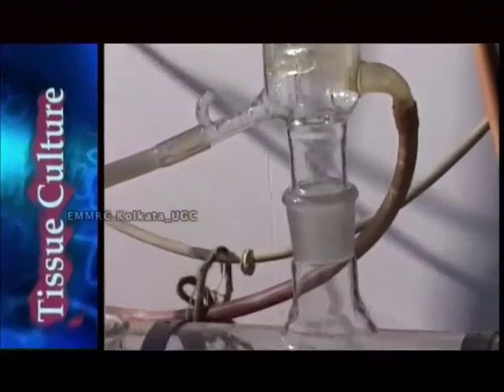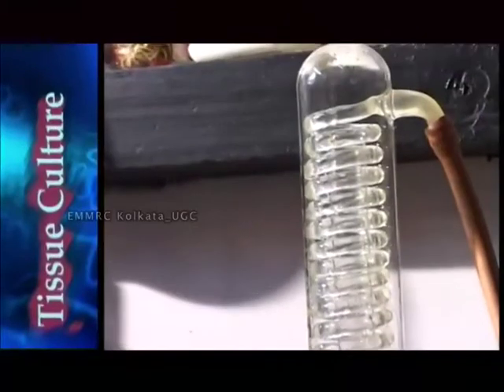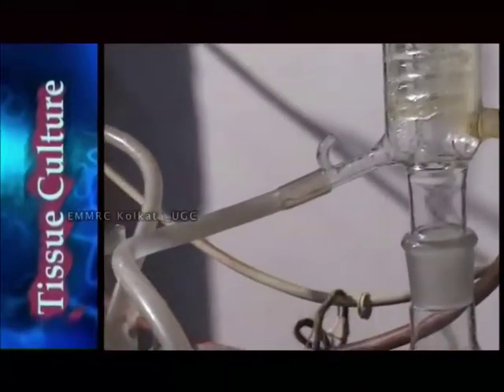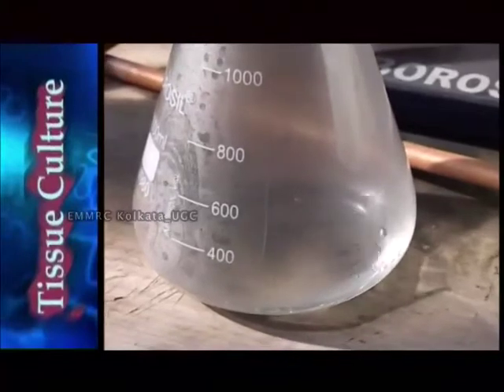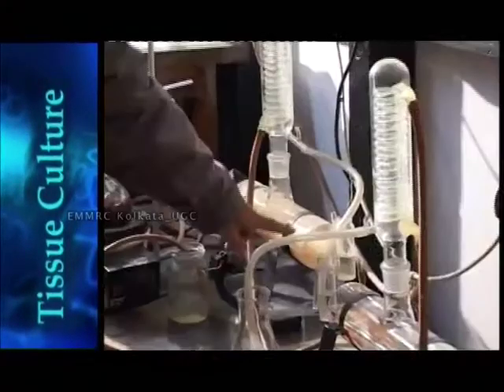If you're not doing research and development, you need not have so many equipments. You need only the minimum, the basic requirement. What you need is one distillation unit to get distilled water, double distilled water. But if you cannot afford that, you can buy distilled water from the shop also. That also serves your purpose, though it is mostly single distilled water, not double distilled. Still, it works. The cost depends on the type of distillation unit you buy, but it is not very costly.